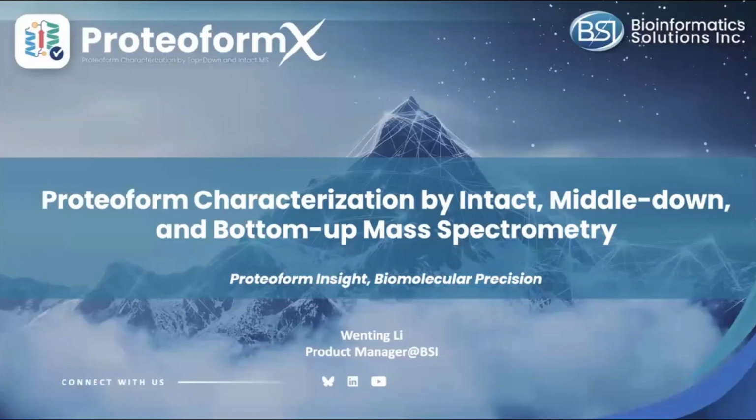In this session, I will give you a complete overview of ProteoformX, our integrated platform for proteoform analysis using intact, top-down or middle-down, and bottom-up mass spectrometry.